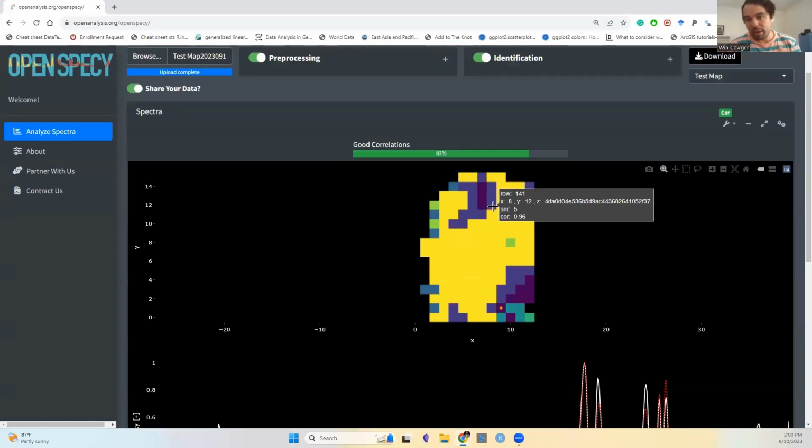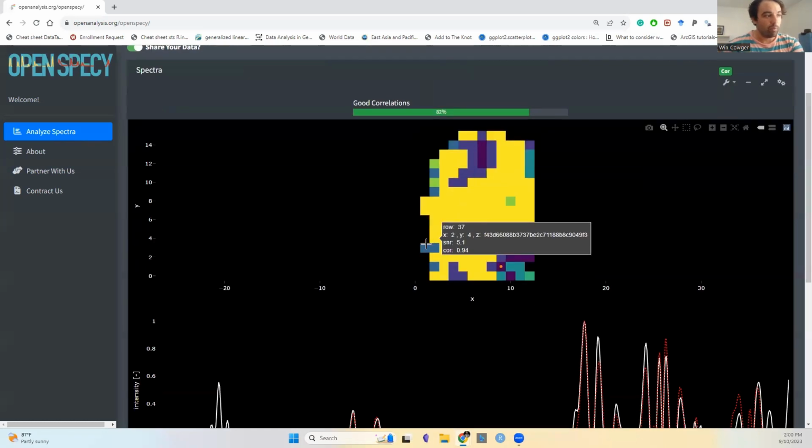So we want to inspect our spectral map to try to make sure that it is fitting what we're expecting. That's a really important part of this. And a lot of times to make sure that you are getting what you're expecting, for me, I took a photograph of this one particle. So I know that there's one particle and where it should be in the image. So what you should do is reference that visible image and this spectral image, and compare the two.